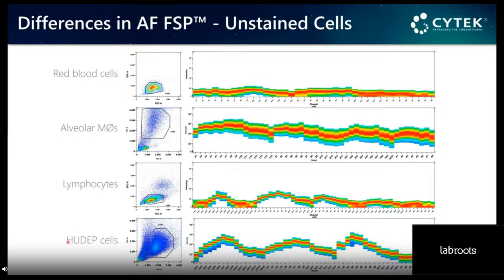And if we now look at these erythroid progenitors derived from umbilical cord in humans, what we are seeing also is high emission in intensity, high out of the UV, out of the violet, and critical out of the blue. Right here, we see emission where PE is going to be showing you the peak of emission.